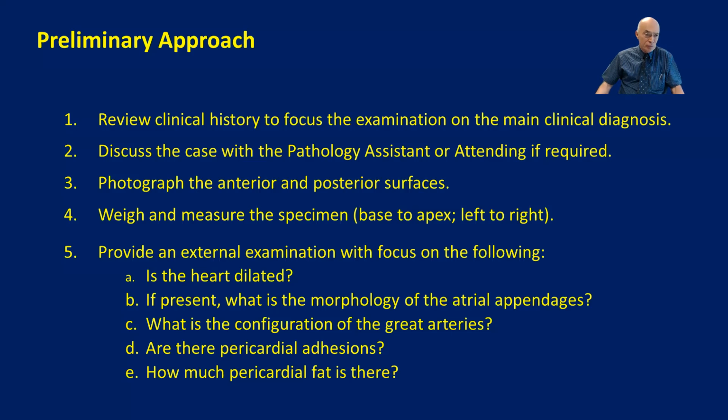And then it's very important to take photographs, especially of the fresh specimen, because when you have fixed overnight, the color and many other things are going to be a little bit changed. You can take pictures later on after fixation, but it's very important to have fresh images, both for the purposes of diagnosis as well as for teaching.